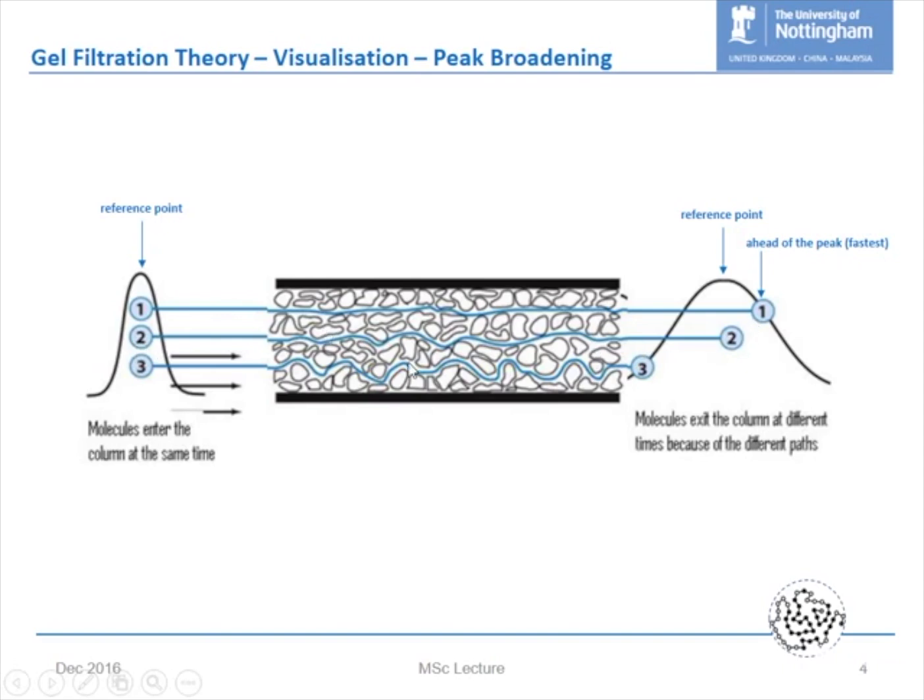But what we've actually got, in a representation like this, is the concept of peak broadening. Now, peak broadening is a problem for chromatographers, because rather than the peaks being nice and sharp and separate, their mean might be the same, but if they're in a very broad form like this, then you can't actually differentiate between them. What they become is unresolved. You have low resolution.